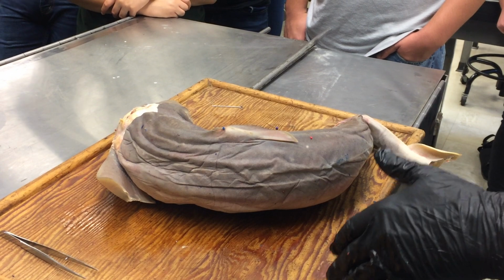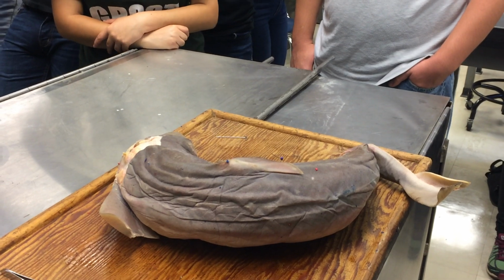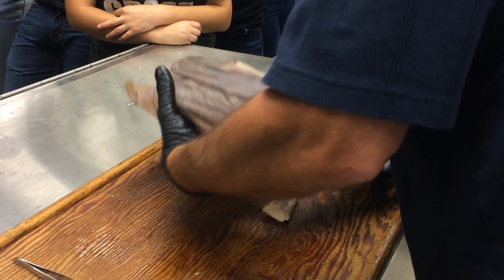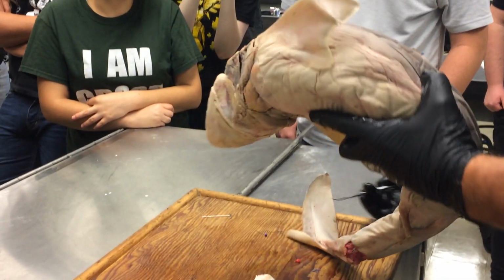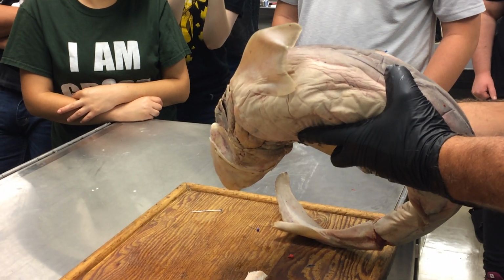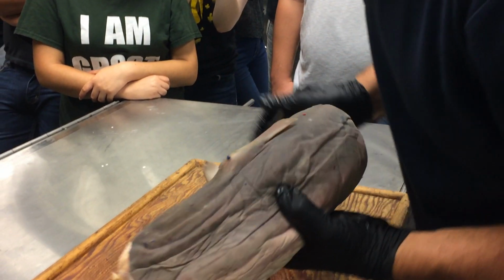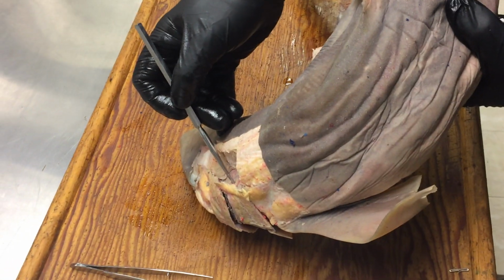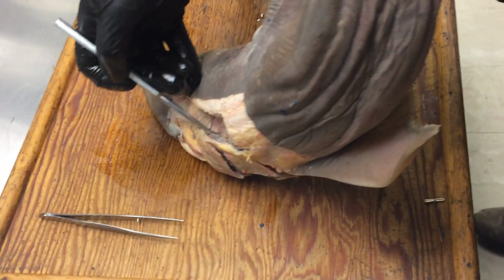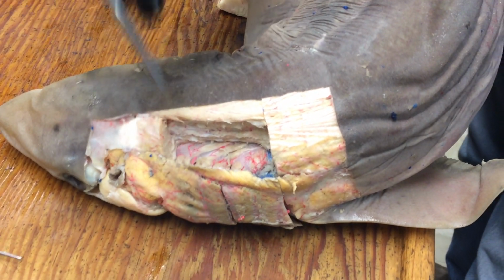So then there's also a muscle a little more laterally, and where the pharyngobranchial connects to the epibranchial element, there's a muscle that spans that joint, and that's called the lateral interarcual. So if you look in, these little guys here, do you see those? In here, those are the lateral interarcuals. Even with this gone, it's a little hard to get people to see. But right in here, there's a series of muscles. Can you see that at all? No. It's hard to point and have you see at the same time. Oh, okay. Right in there? Yeah. Okay. Those are right in here, this whole series. Those are the lateral interarcuals.